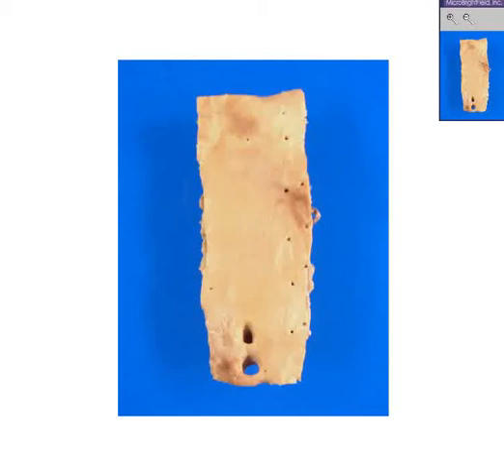Here is an aorta that has been opened up, and you could probably see a celiac and a superior mesenteric artery here. And if you look closely at the lumen or endothelial side of the aorta, you'll notice it is not quite uniformly yellowish orange like it should be. Please note that here, here, and here, and here, and here, and here are little yellow streaks.